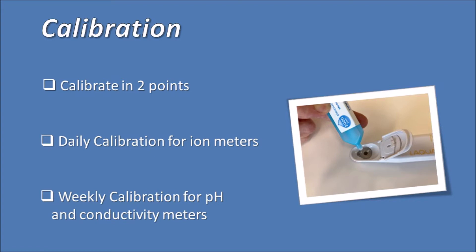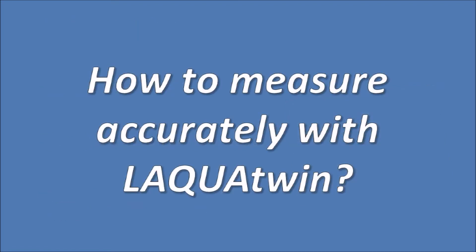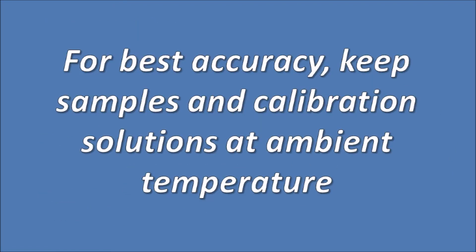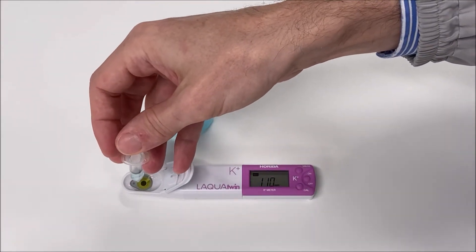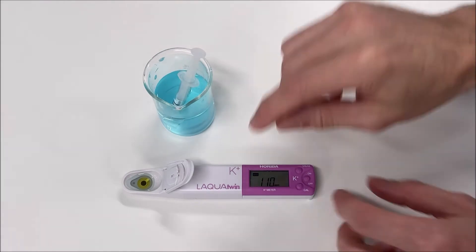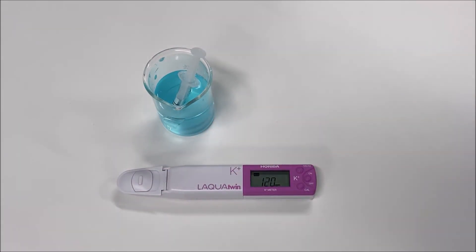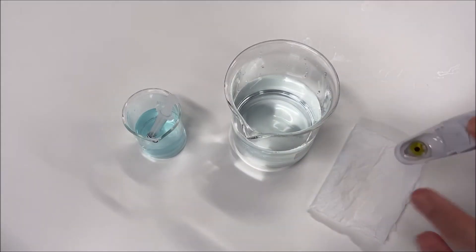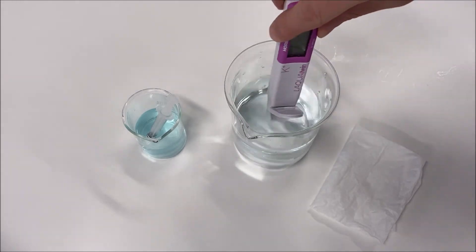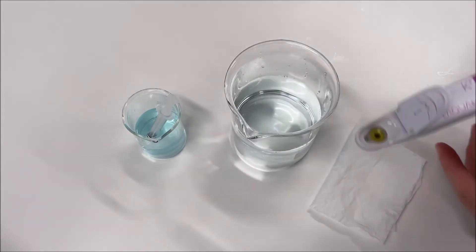Please check the video link for Laqua Twin calibration for more info. For best accuracy, we recommend keeping sample and calibration solutions at ambient temperature. Add your sample into the sensor and make sure that you cover both areas of the electrode. Close the light shield. The smiley face will be displayed when the reading is stable. After completing the measurement, wash the sensor with deionized water and dry it with a soft cloth before you start your next measurement.